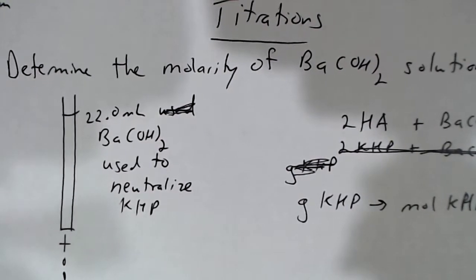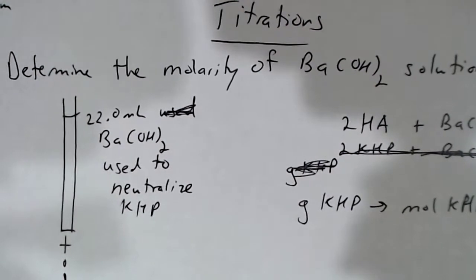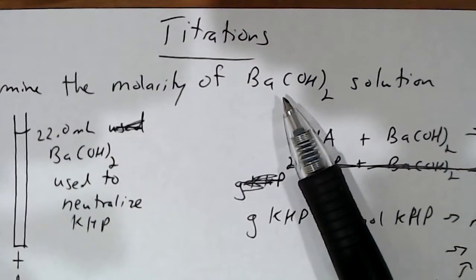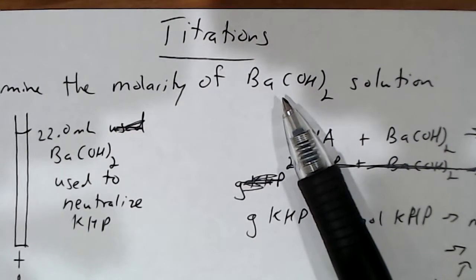Hi everyone. So we'll talk about titrations here. Let's say you want to determine the molarity of a base solution or an acid solution or an oxidizing agent or a reducing agent. You can do all that with titrations.